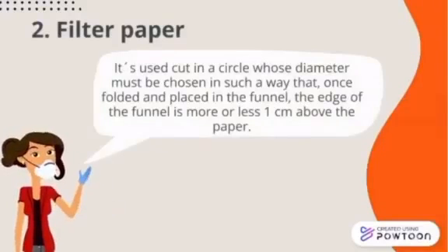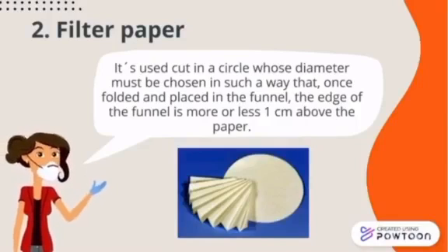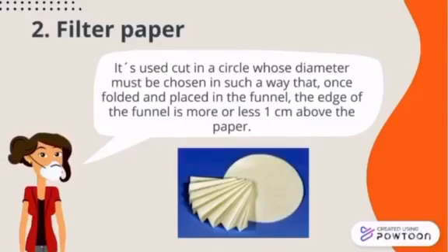2. Filter paper. It's used in a circle whose diameter must be chosen in such a way that, once folded and placed in the funnel, the edge of the funnel is more or less 1 centimeter above the paper.